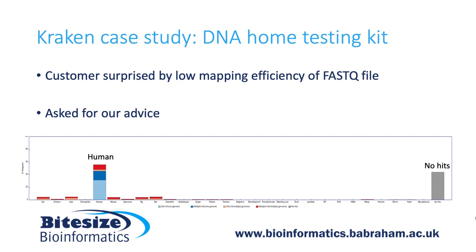Also, as part of the deal, they were offering to supply the FastQ file associated with that particular DNA sample. So the customer was quite interested in being able to study their own sequences and had the bioinformatics capabilities to do this. So they got the FastQ file back and they started analyzing it.